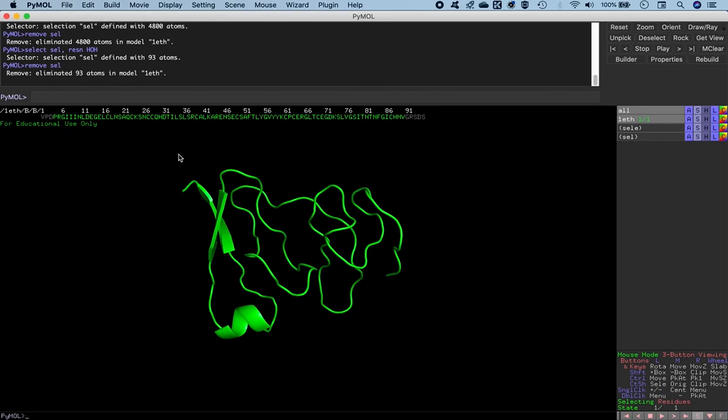So once we have a licorice representation, we can specifically annotate those atoms that will be responsible for forming the amide bond or the peptide bond. Okay, so let's go ahead and do the selection. Without typing in here, we can do the selection right away from the sequence menu out here, which is select for the proline, and you see the selection has been made for the proline, which is the N terminal, and then the valine, which is the C terminal out here.